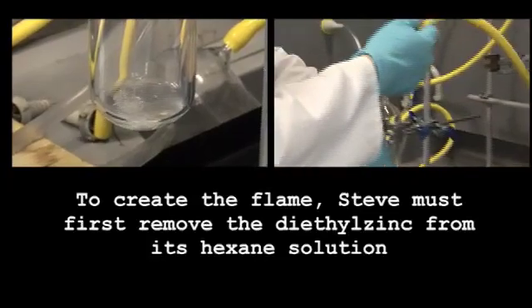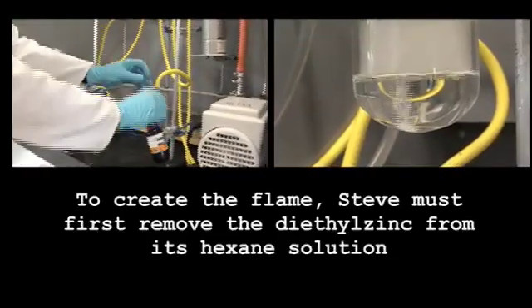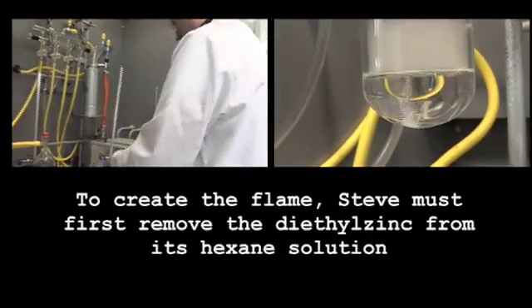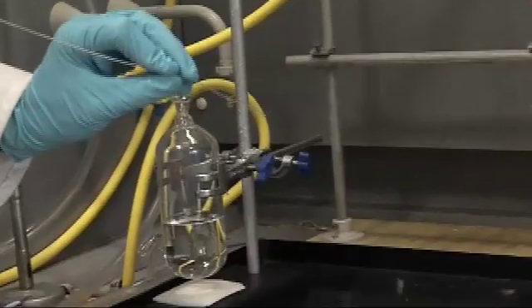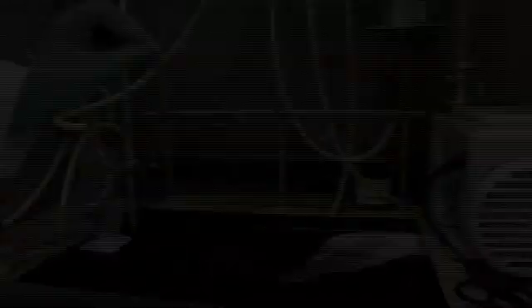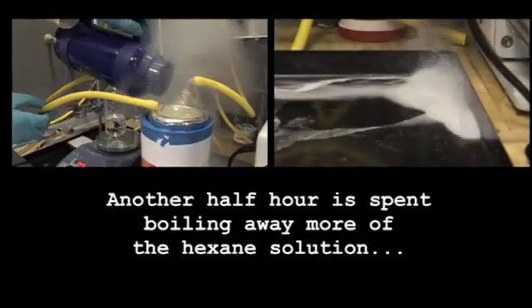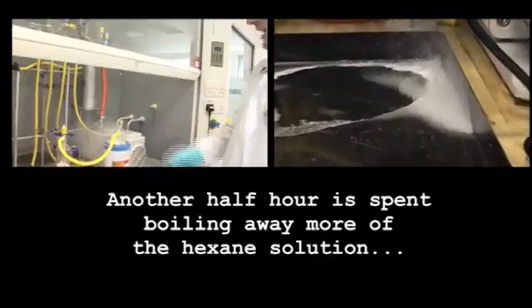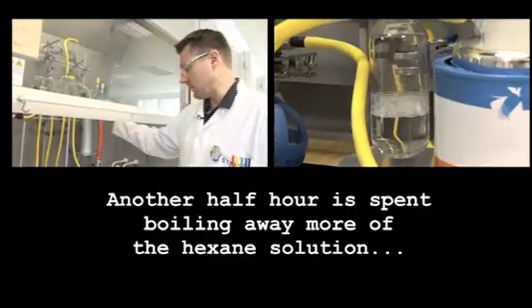So what's coming out there? That is diethyl zinc in hexane. What I'm going to do is concentrate this down — all that hexane, which boils at about 60 degrees at one atmosphere — we're going to pull that all away and just leave the diethyl zinc.